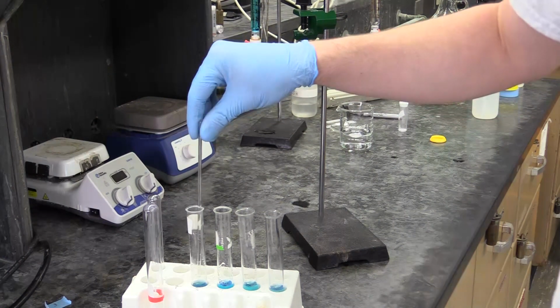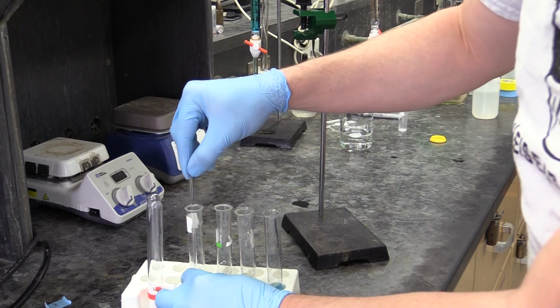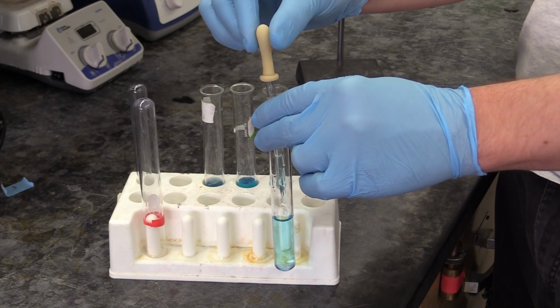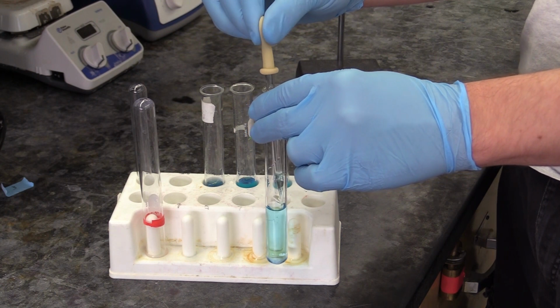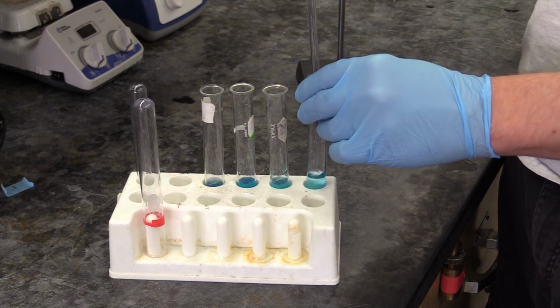Once you have the stock and water added to each tube, you're going to want to mix the contents. Now there's a couple ways to do this. You can either stir with a stir rod, or you can use a Pasteur pipette to pump the solution up and down a few times. Just make sure you rinse your rod or pipette between solutions so you don't cross-contaminate them.